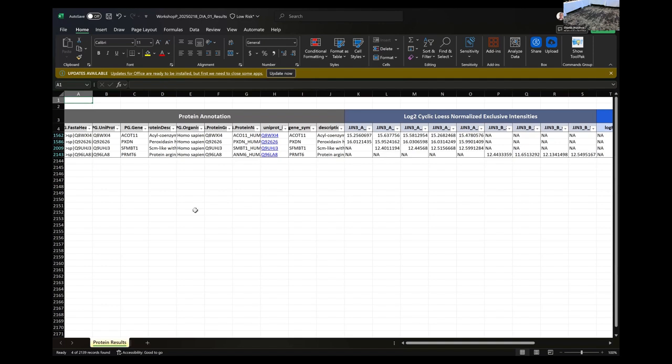We even send you the raw files, and you could look at those. I can show you some other ways in which we, and it's probably a little bit outside of what you do, look at file size as we're collecting the data. They tend to all be about the same size. If you have one that's dramatically different, that usually means that we maybe had an injection error. We get air bubbles sometimes, and so it's not injecting your sample, it's injecting air. And so we have to go back and evaluate all of that.